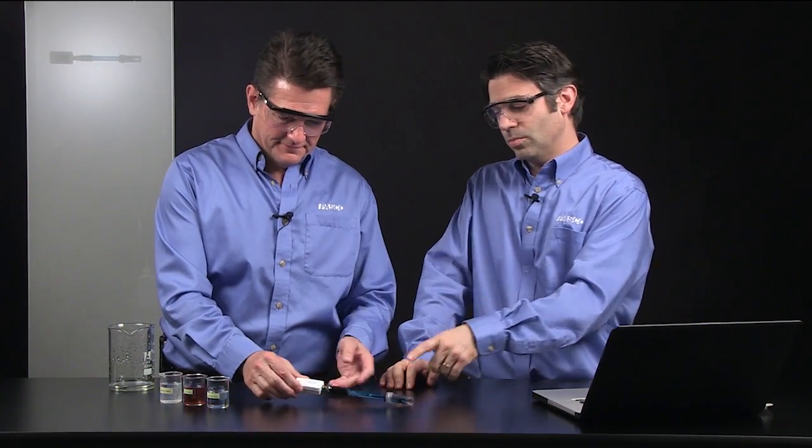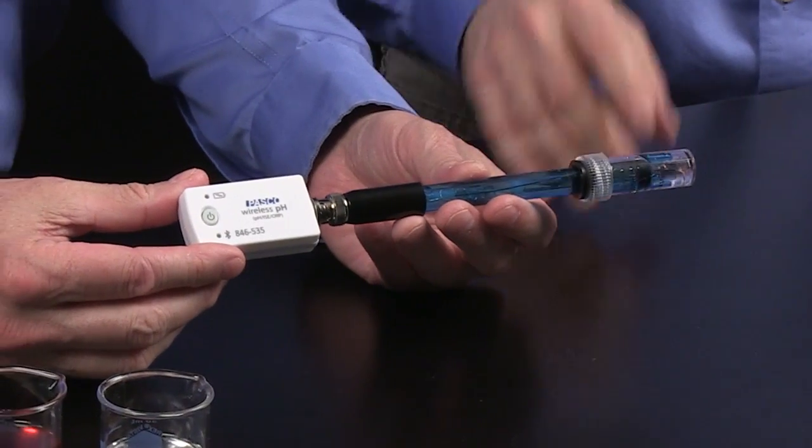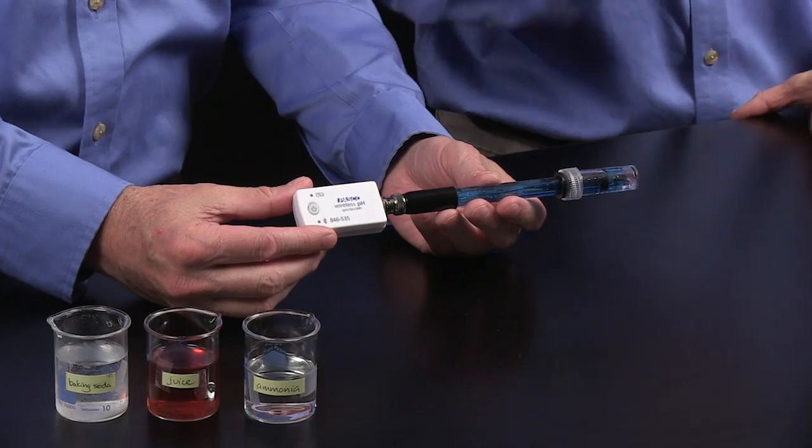Hi, I'm Tom Loschiavo, Education Manager here at PASCO Scientific. And I'm Ron Fieldhouse, Training Specialist here at PASCO. We're here today to talk about the wireless pH sensor, and we're going to do a little experiment using some household chemicals.